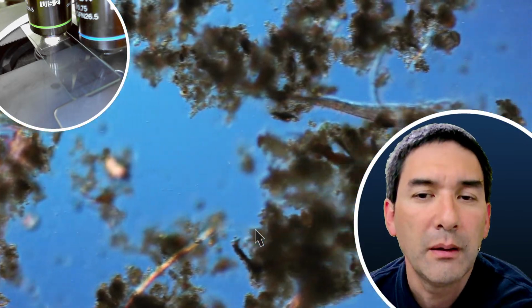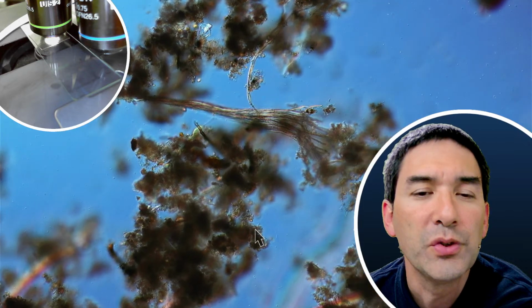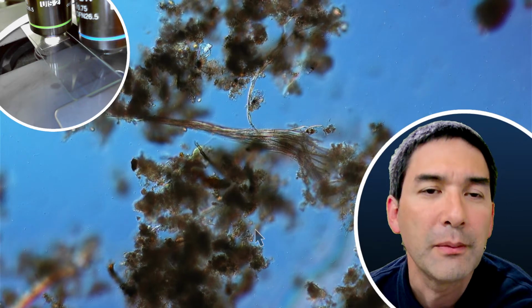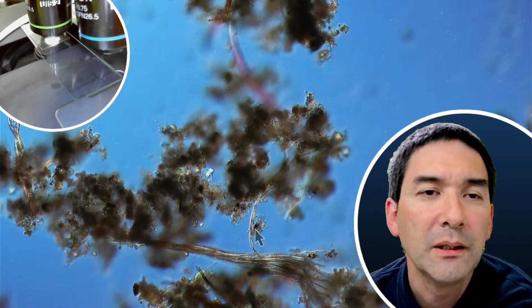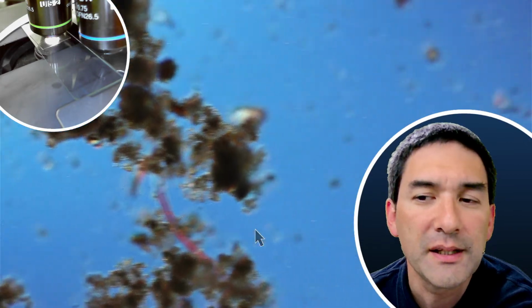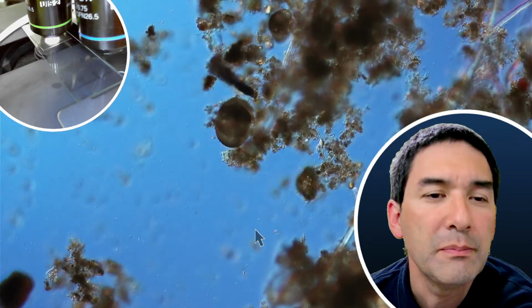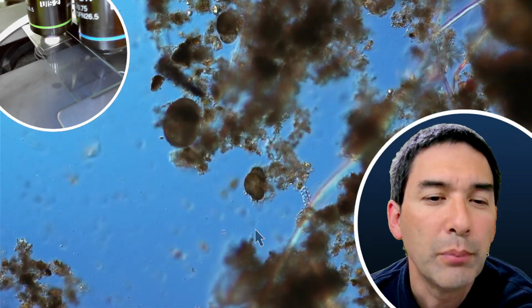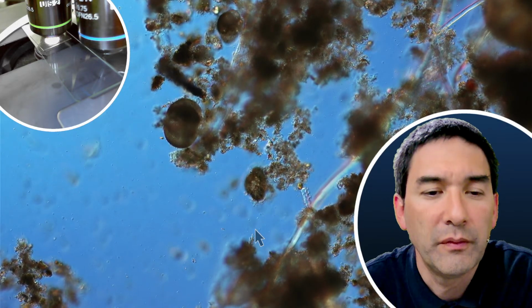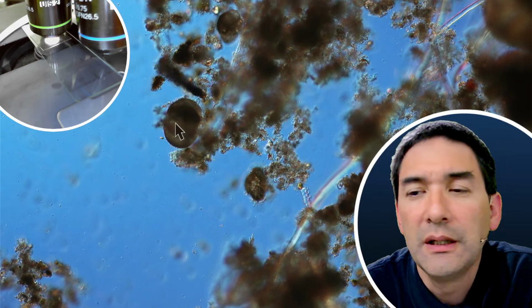Later on, I'm going to show you what you can do concerning time-lapse videos. So all of those fibers that you see could be, of course, plant fibers. Usually some decomposing material from plants. Here again, this might be also pollen grains. This triangular shape is a little bit indicative of that. So here as well. This here possibly as well.